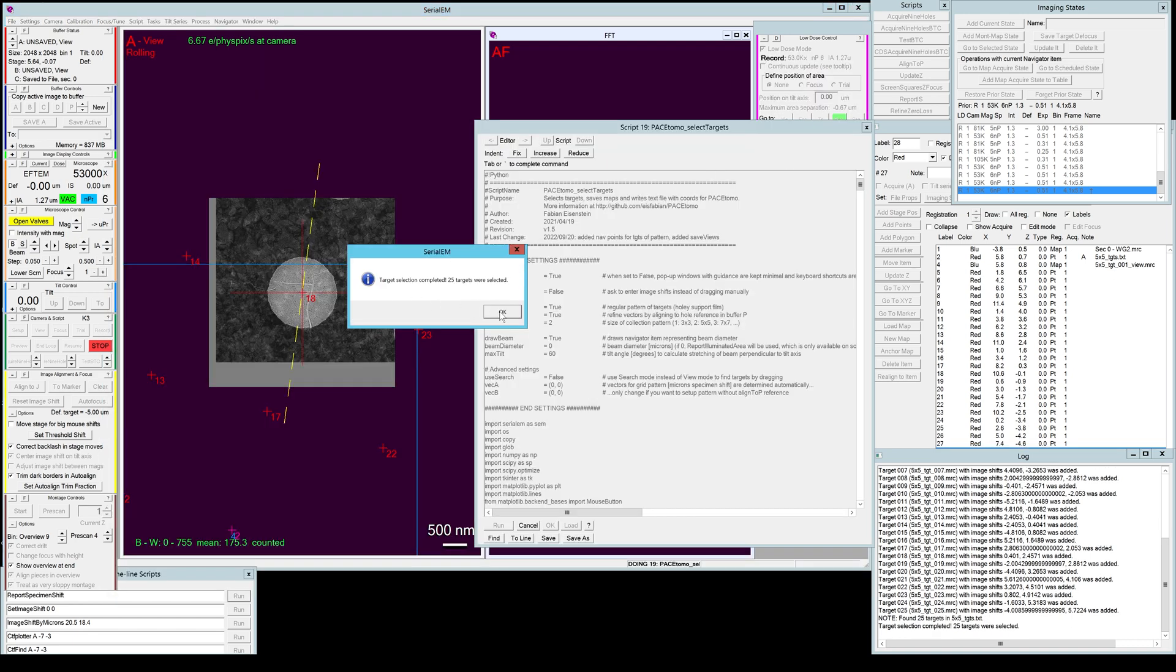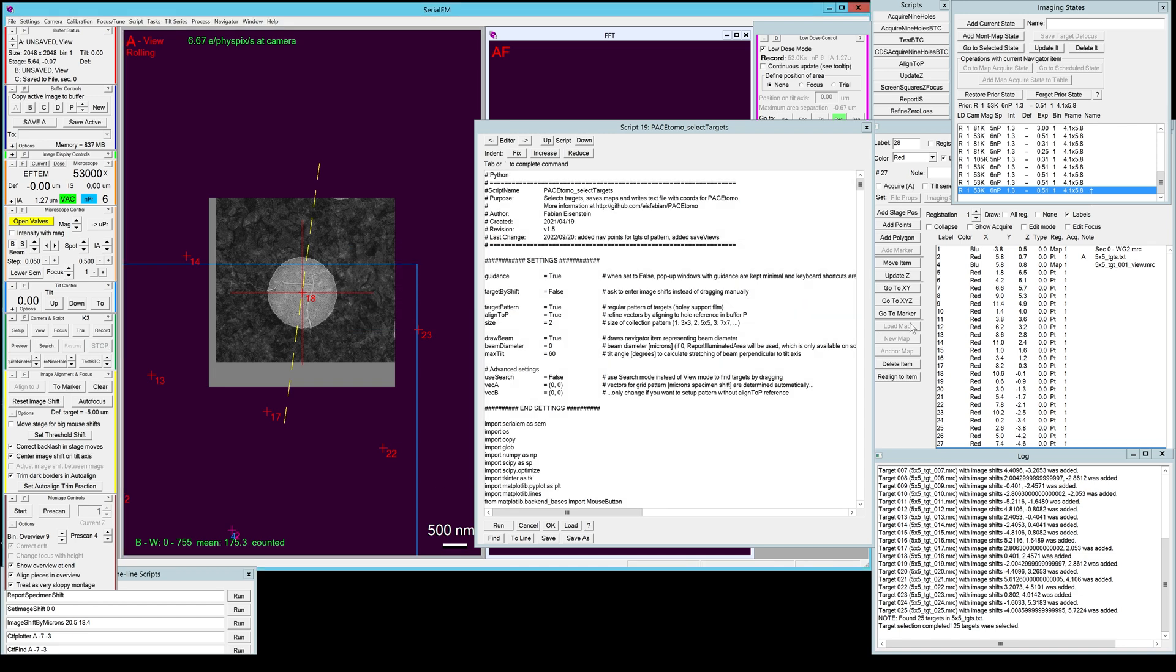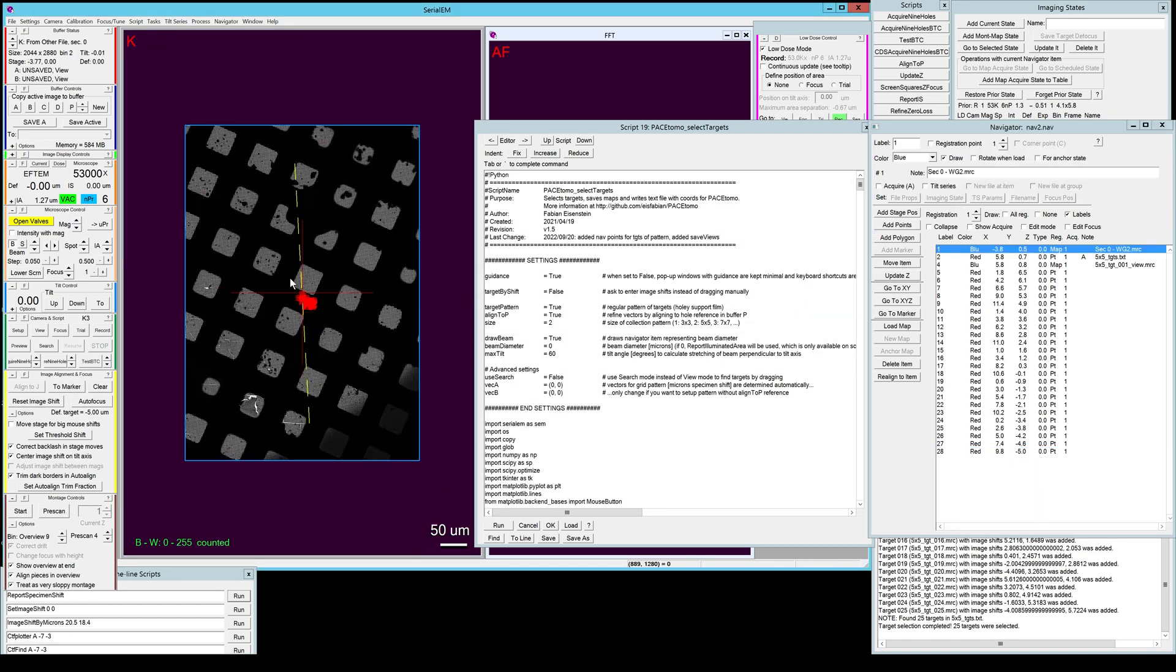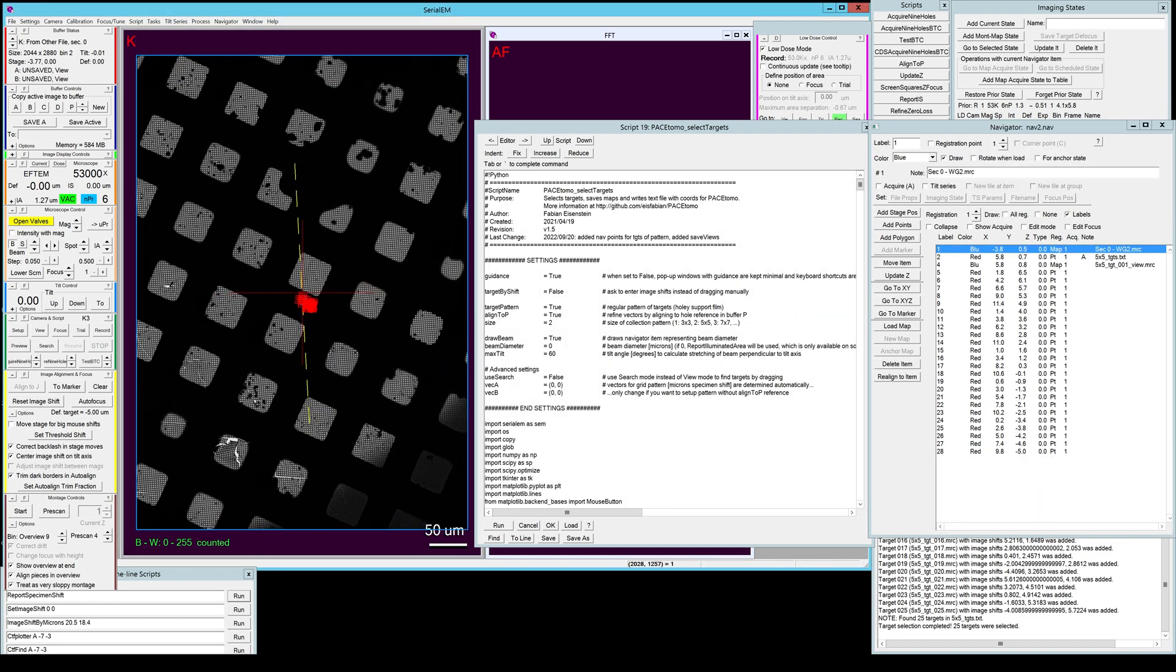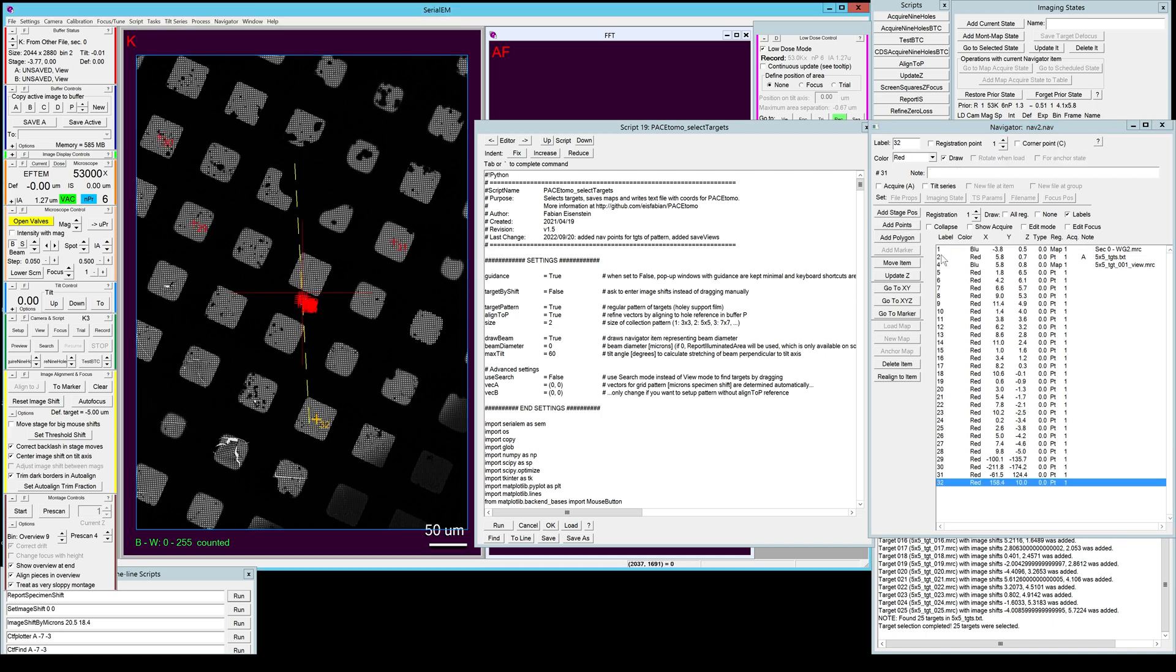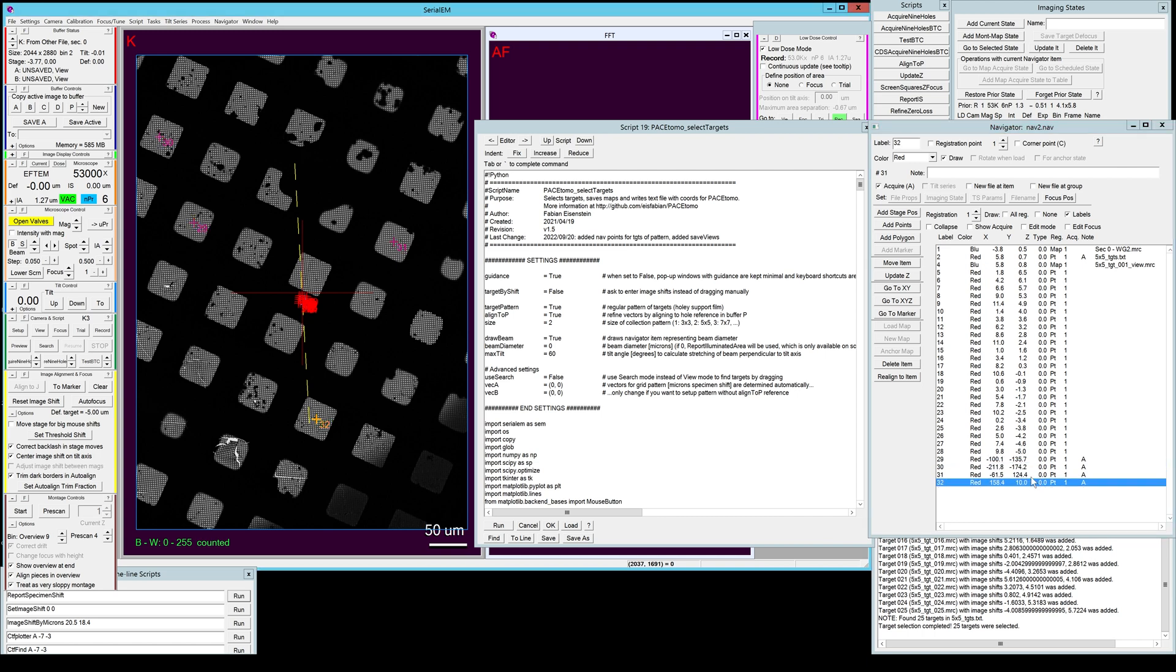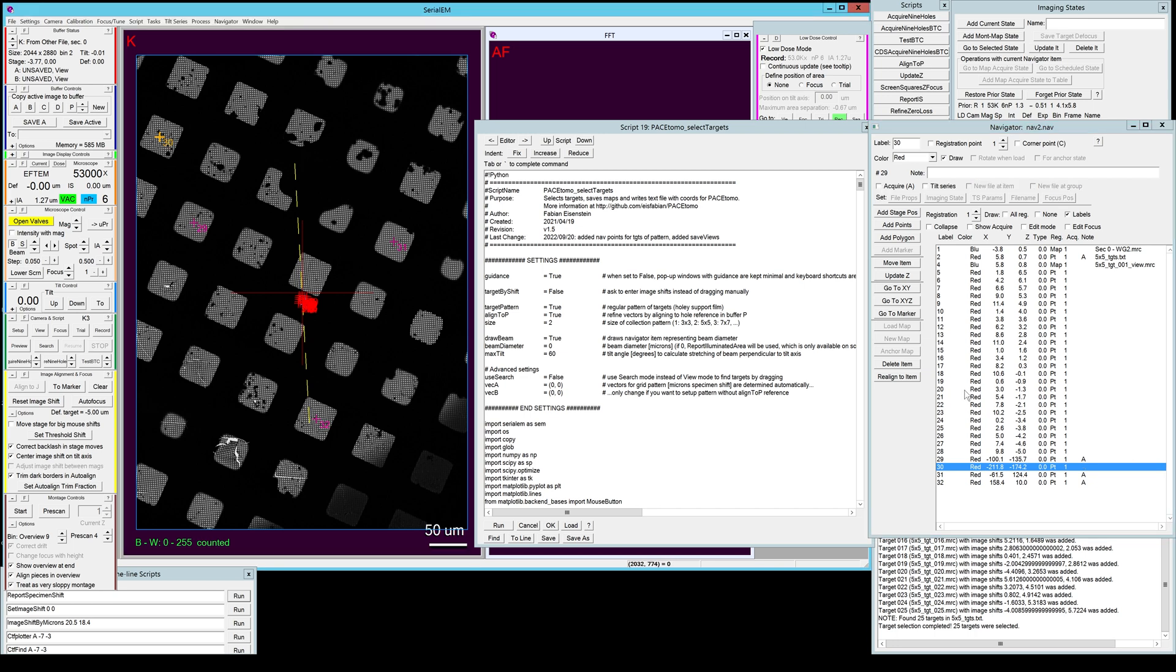Let's close this window for now and it tells us we have 25 targets selected. Now we can go to a grid map or a square map and we can add points and then we can set all these points to acquire or a subset of them.